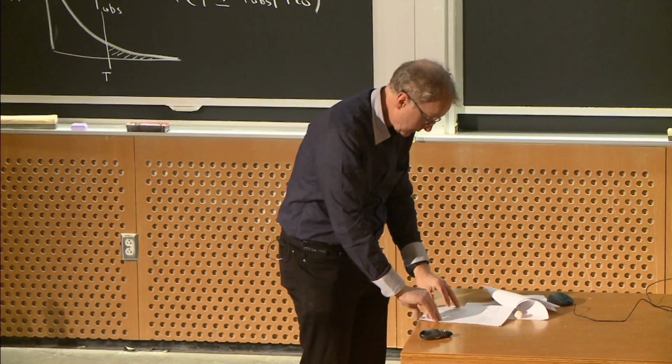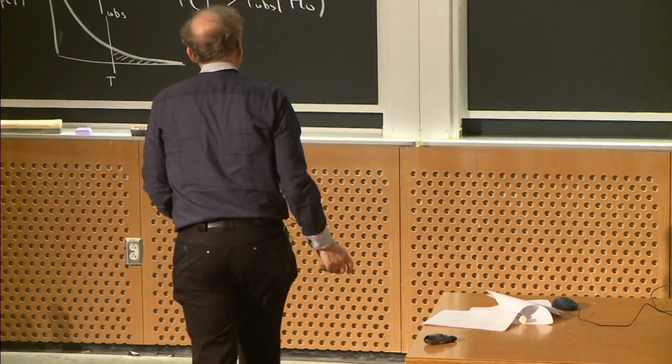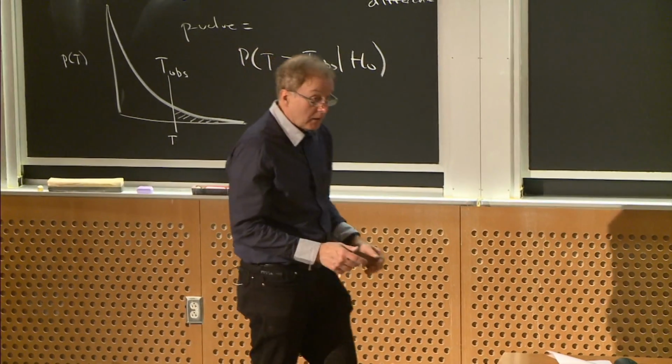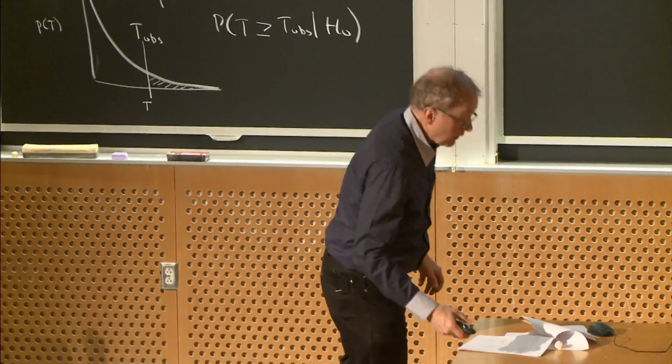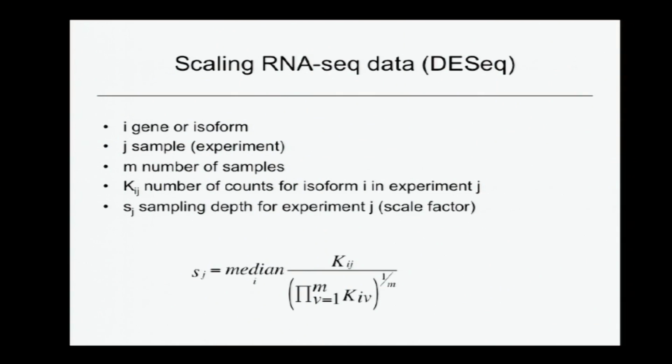Okay, so let's now turn to evaluating RNA-seq data once again, and I'm going to describe a method called DESeq for determining differential expression.